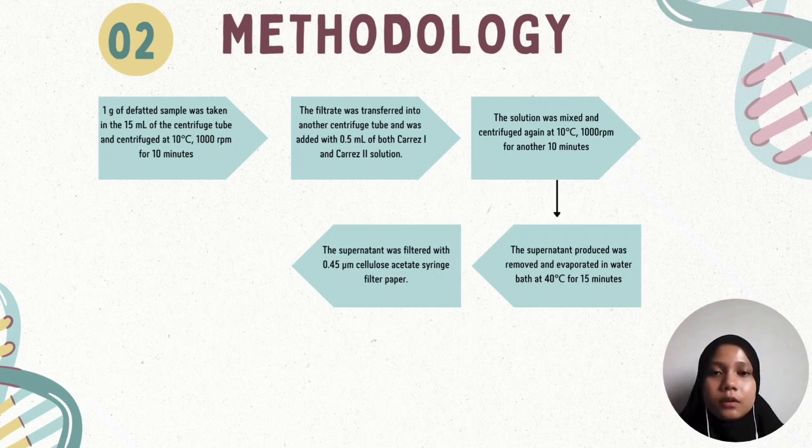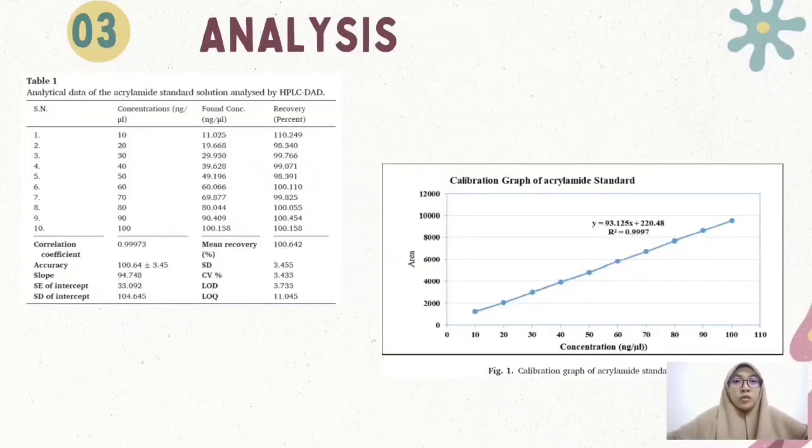And lastly, the supernatant was filtered with 0.45 micrometer cellulose acetate syringe filter paper. So that is all from me. Thank you. Assalamualaikum warahmatullahi wabarakatuh.